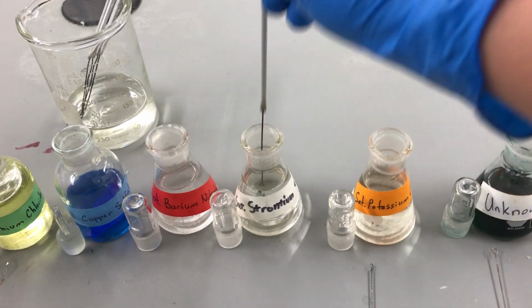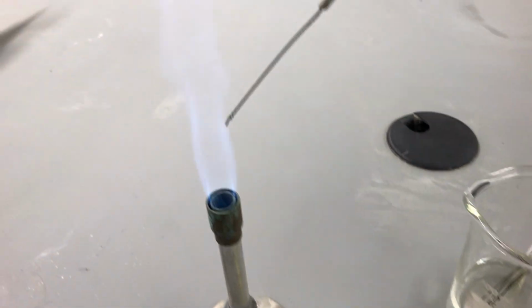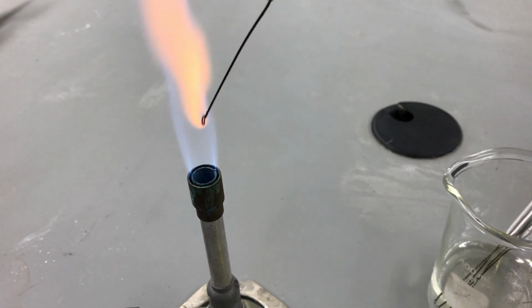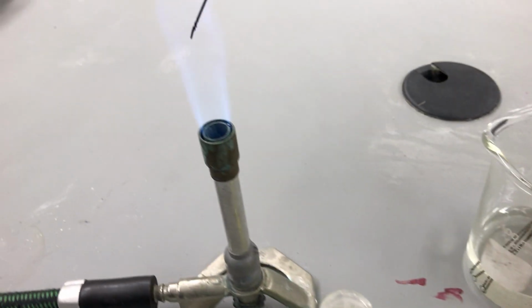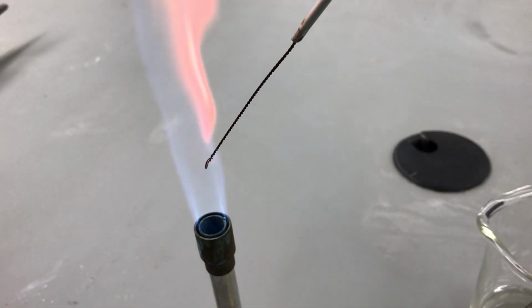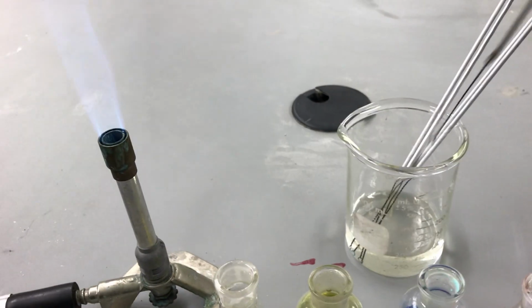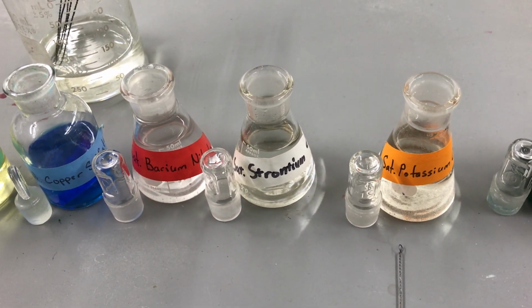Next up, we have our strontium. Use our loop to the strontium. And that one, a definitely reddish, but a more orange red. So let's try our strontium again. So it's got kind of an orangey red color to it. It's kind of a more orange than the lithium, which was more of a purple red. So once again, our strontium was an orange red.